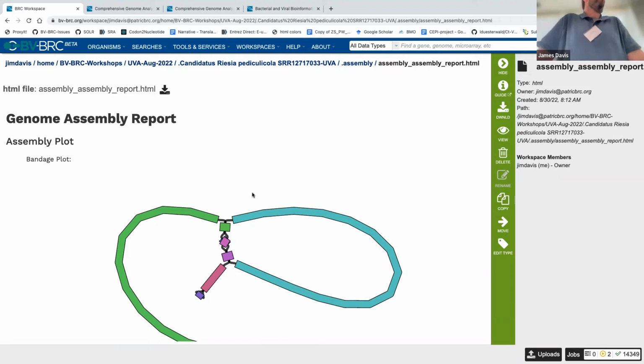This is a really important point: when do I know that I'm dealing with a plasmid? To repeat what Alan said, the Unicycler report in the FASTA header will say that it's likely circular, and most plasmids are circular. Or you could attempt to assemble with plasmidSPAdes. And sometimes the depth of coverage is much greater than that of the surrounding chromosomal regions.